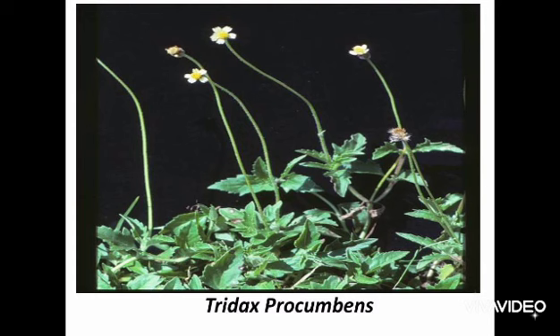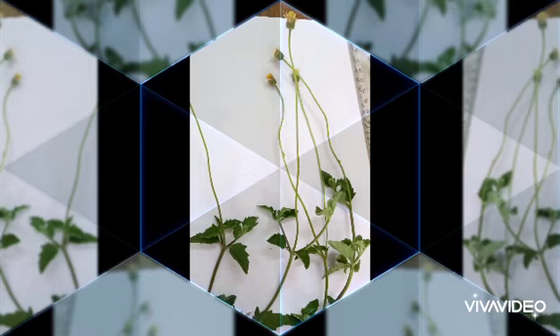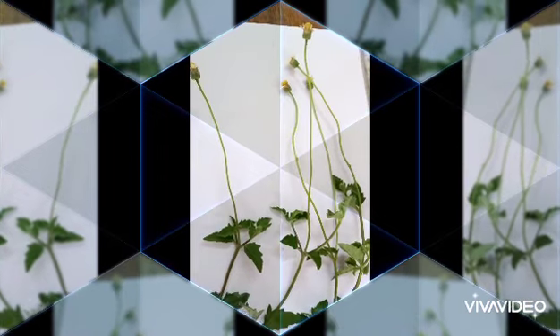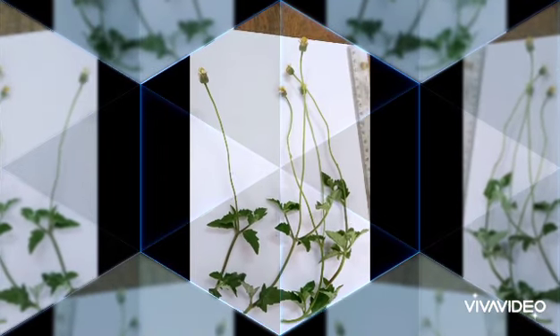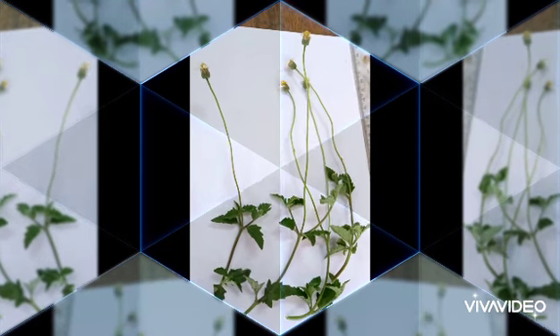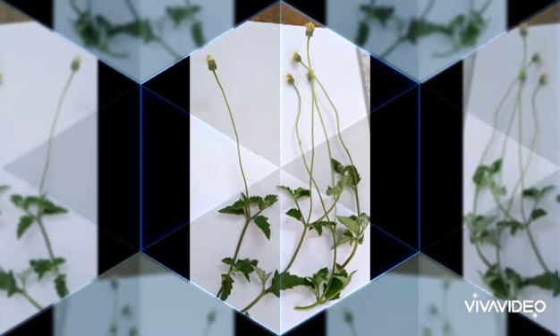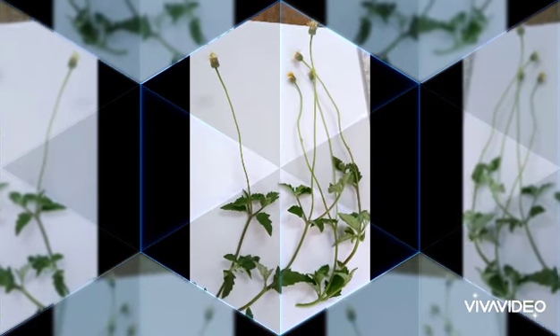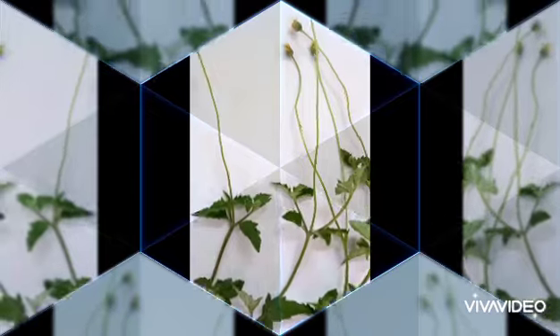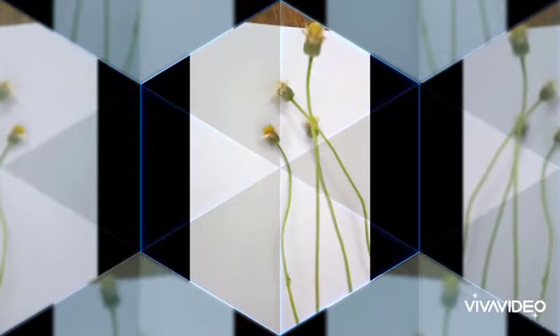Let us start taking freehand sections of dicot stem. For that I am using the Tridax plant stem. Tridax Procumbens is a wild growing ephemeral mesophytic prostrate herb belonging to the Asteraceae family, which is a good example of dicot stem.